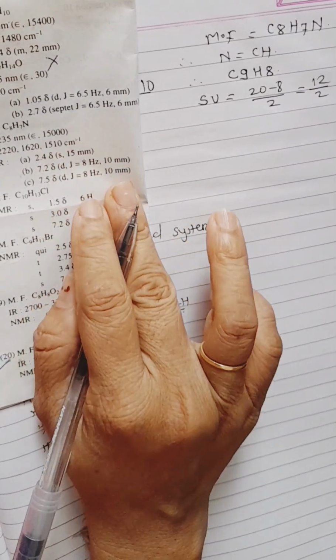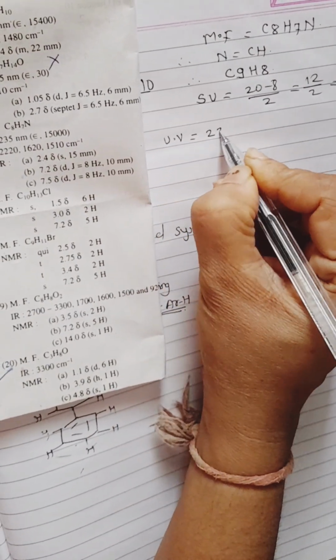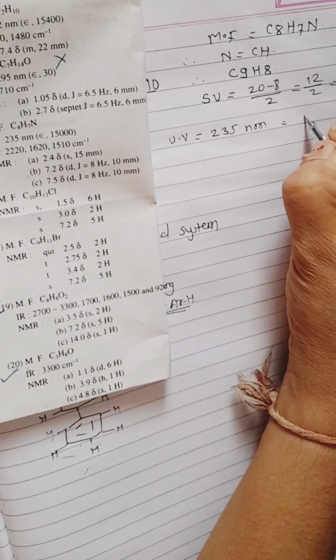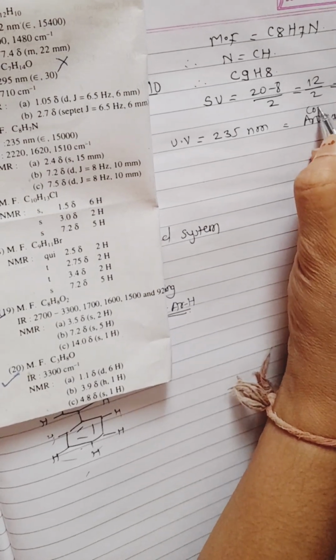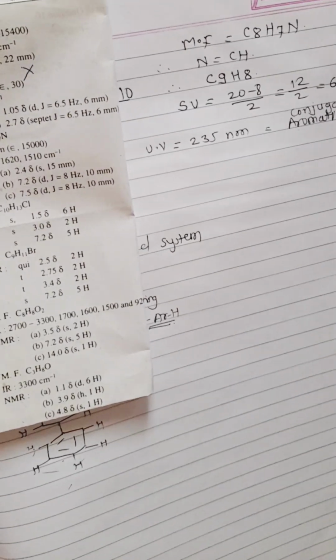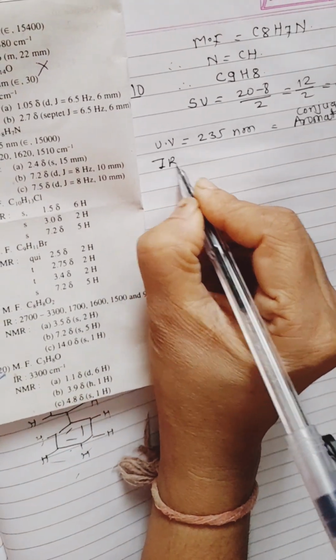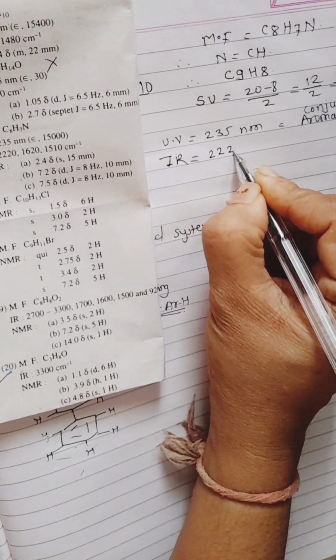Now friends, look toward the UV data also given here, 235 nanometer. This also shows the aromatic ring or conjugation, and there is somewhat of a chromophoric group also joined to the benzene ring. So friends, the next data is also very important, that is IR, 2220.